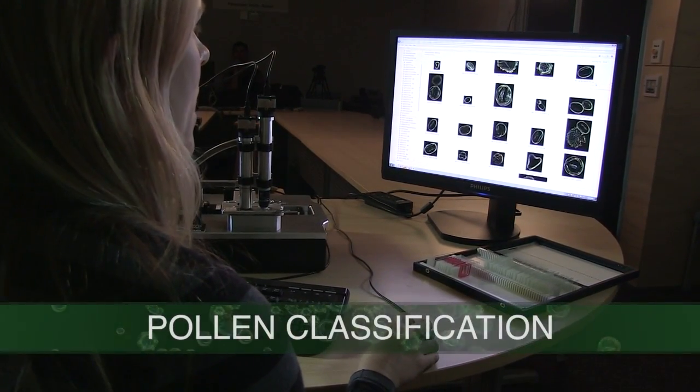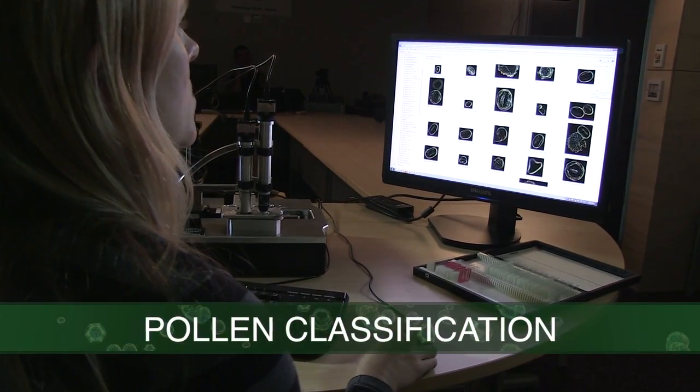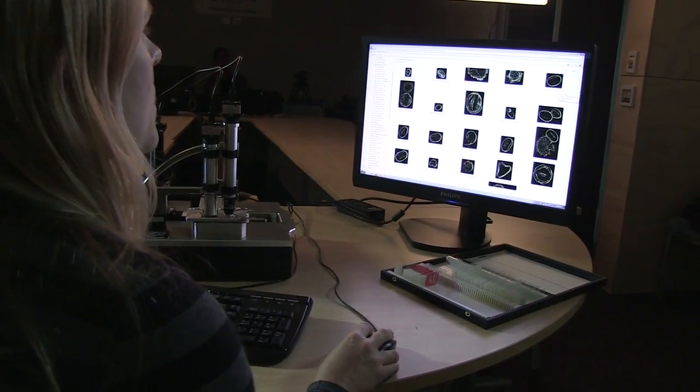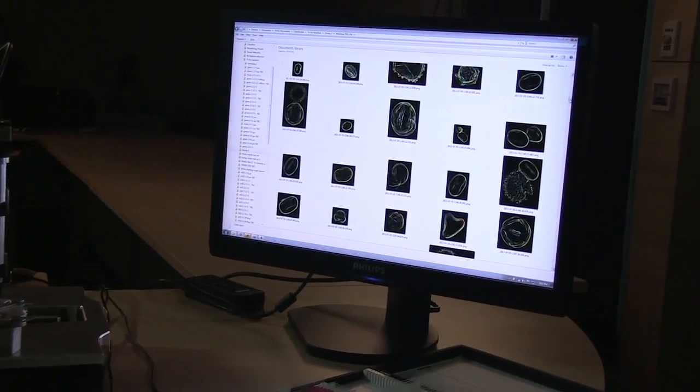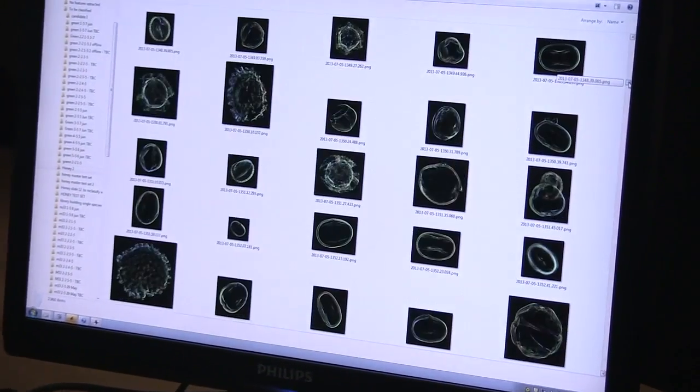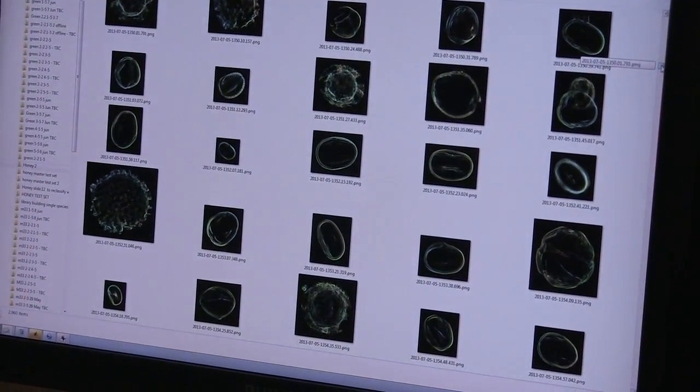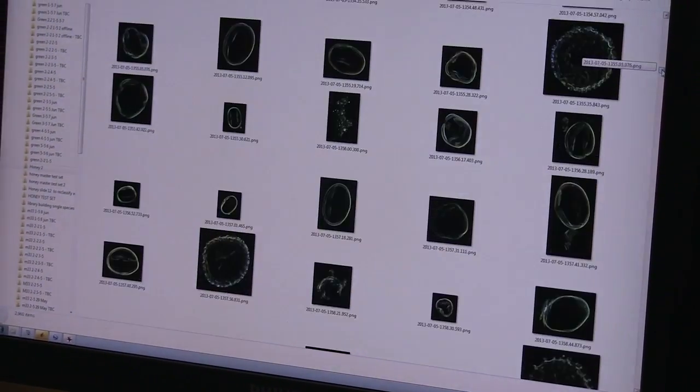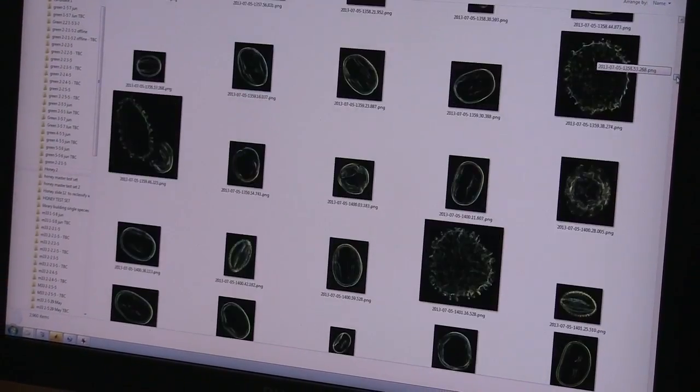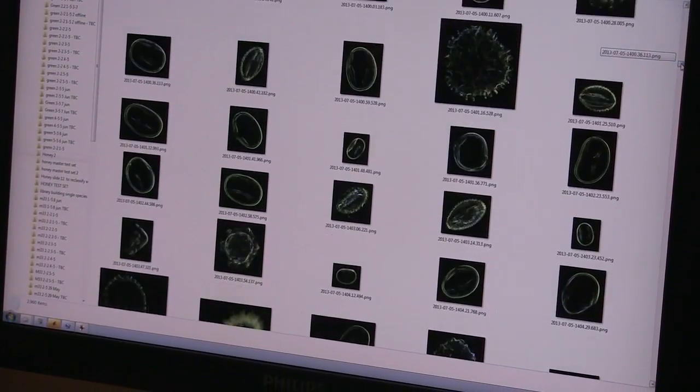So after the high resolution camera has finished imaging every pollen object that's detected on the slide, those images are then presented in a folder which is what we can see here. So these are an example of a series of images collected from a sample of honey this time. So we have many different types of pollen in this sample and here we can see those images in the one folder.